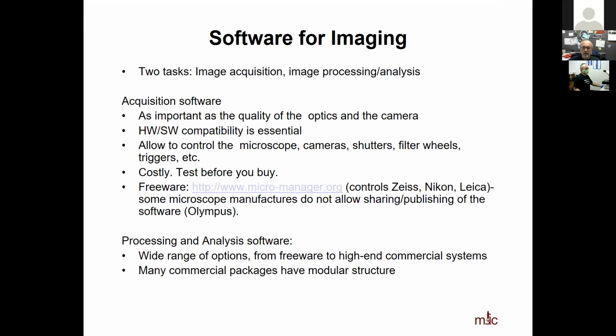So that's the noise, and then there's a little blurb on software, but maybe we don't really have to talk about it too much. Just to mention, if you buy a microscope, it typically comes with control software. People who build their own microscopes probably write some code, but there is also a great piece of software, Micro-Manager, which can control lots of microscopes and cameras and other hardware. You can give that a try because it's free.